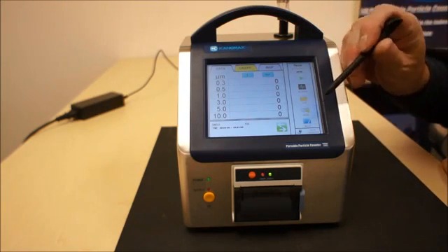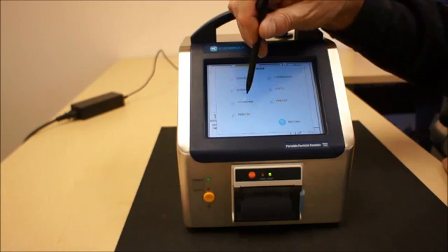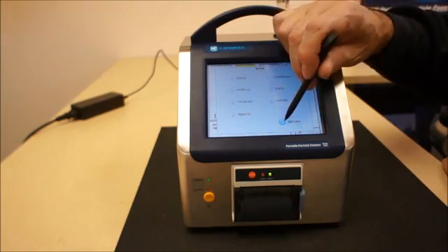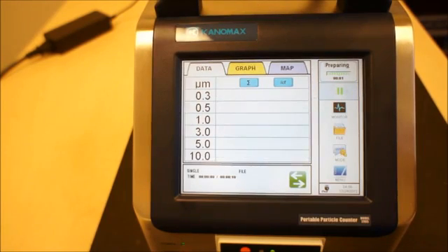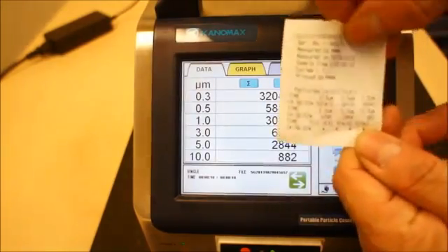The unit has different modes: you can do single channel, intervals, a standard count, a remote count, a continuous count, then look at your statistics, and set presets. This is representative of a single count in standard mode. The unit will wait ten seconds, preparing for measurement so you can step away from the instrument. Once that ten seconds is reached, you'll see it counting through the cycle you've set for a single determination. Once it completes, it will print out and save the data in the instrument as seen here.